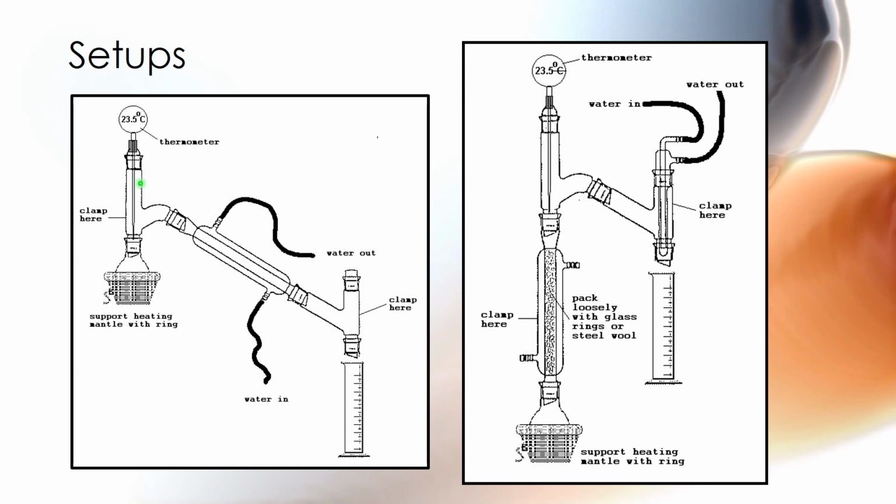And if something's not going or if it's staying stuck, then you need to come and get one of us because it may need some grease. We use a silicone-based lubricant on these joints, and they need to be clean, and sometimes we need to reapply the grease, but we do so sparingly. You don't want them too slippery either.